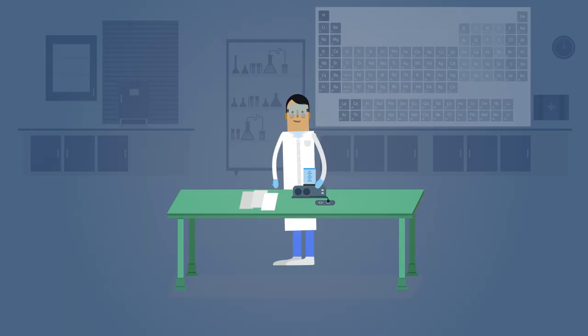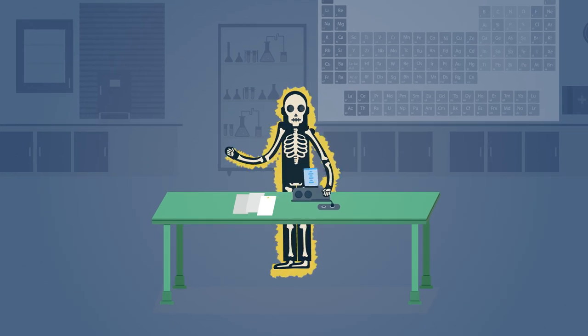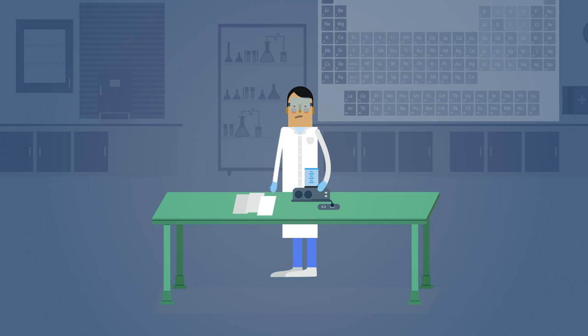Next, read the procedure to identify physical hazards that could arise from using equipment. For example, Bunsen burners and hot plates can cause burns or fires. Or electrical equipment could short circuit, giving you a shock or starting a fire. Finally, identify any extreme hot or cold temperatures as well as high or low pressure. Handling extremely cold materials can cause frostbite, while high pressure can cause things to explode.